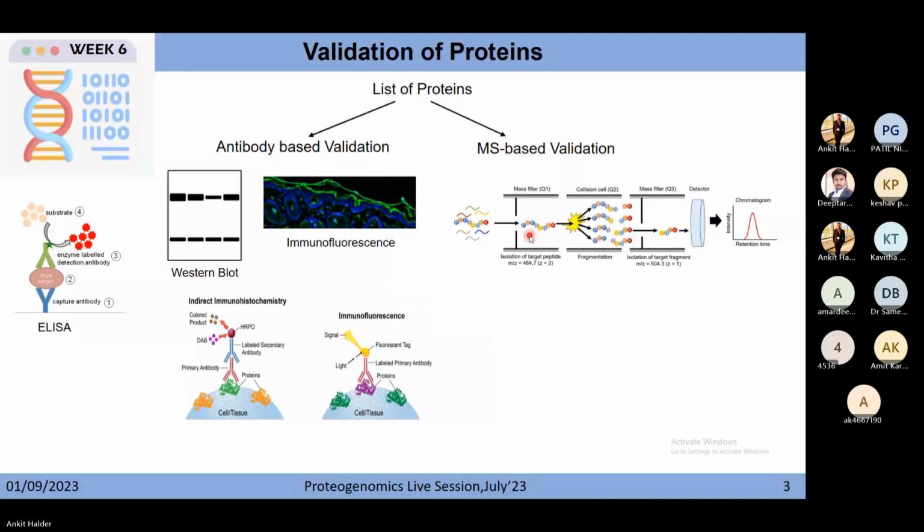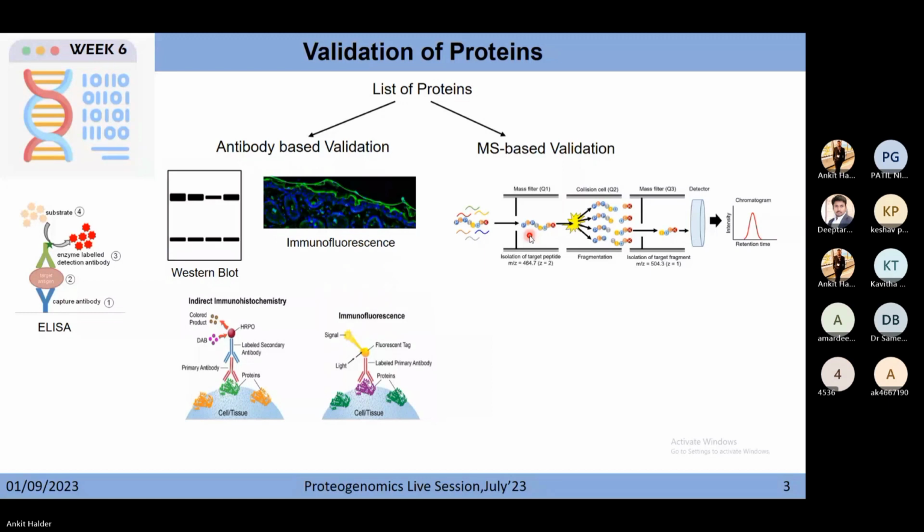So now we have different mass analyzers. In the global set, whenever we are doing a discovery set, we use different kinds of parameters and techniques to try to find out all the proteins in the sample. So as many ions as can be generated are generated, and as many ions are detected. One's goal is to find out those particular proteins.